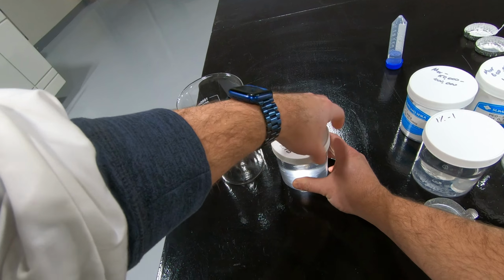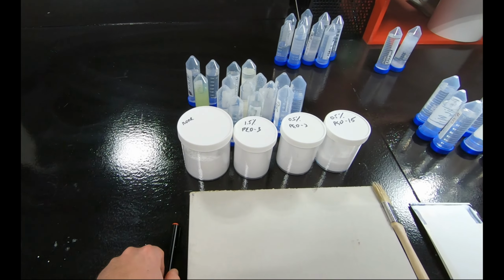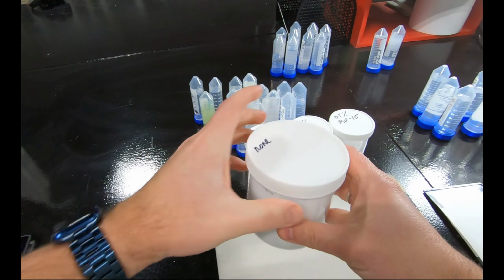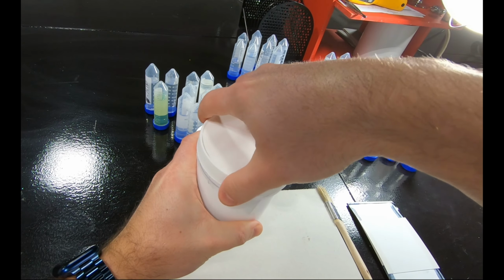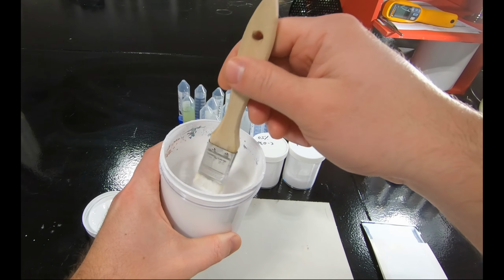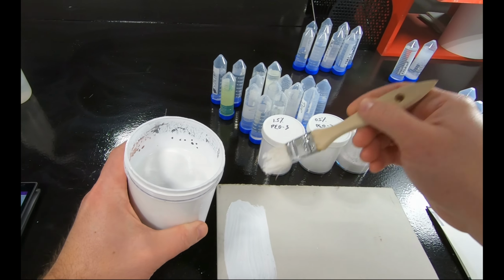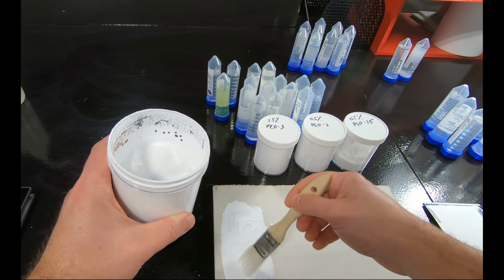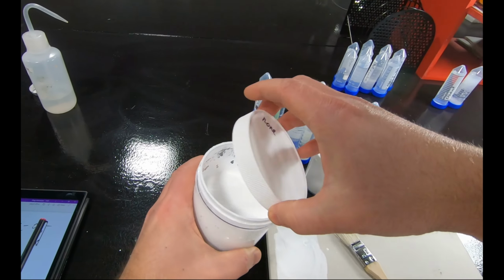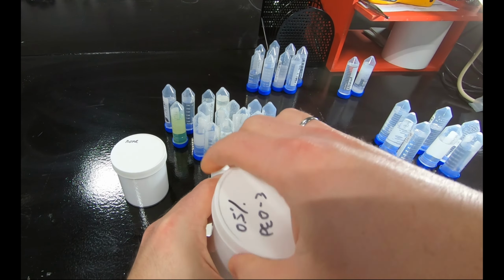On the second part of this video, I'm going to show effect of the polymer thickening on the semi-gloss wall paint, and this sample has no thickening agent, so as you can see, the paint is just dropping. It's a semi-gloss white paint, has about 60 to 70% water in the formulation.